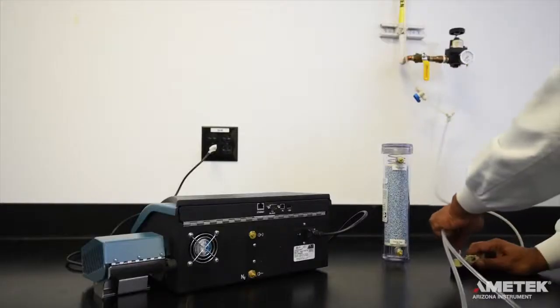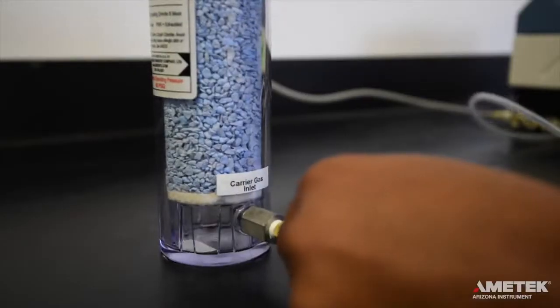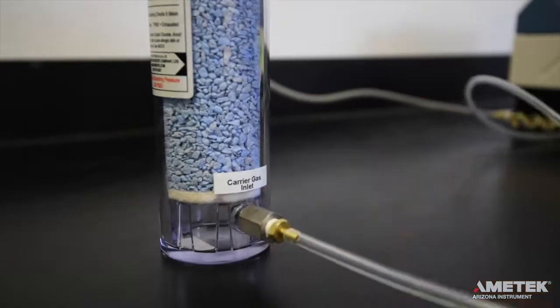If the location where the instrument is to be used is plumbed with nitrogen or compressed air, or if you plan on using a compressed gas cylinder, use the clear tubing from the accessory kit to connect the dry gas source to the carrier gas inlet port on the desiccator.